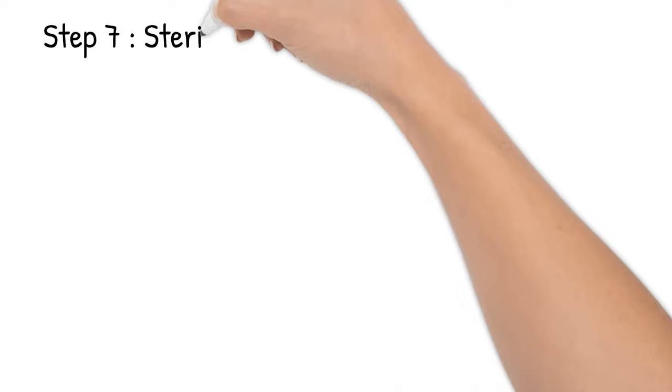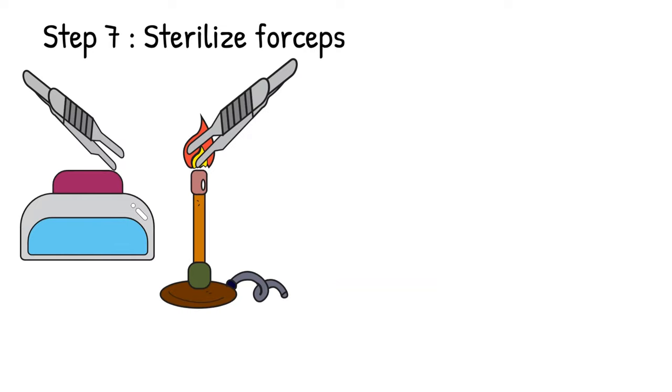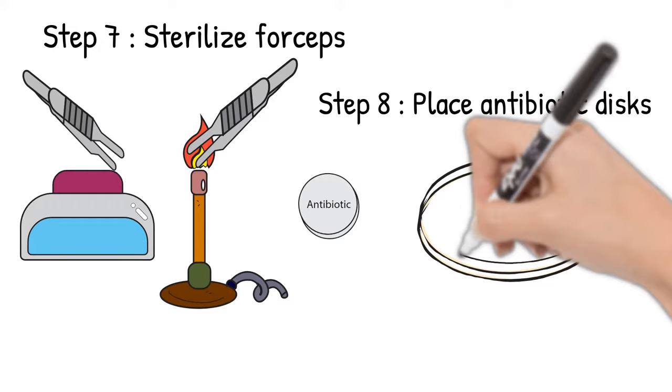Step 7: Sterilize forceps by dipping it in alcohol and pass it through flames. Step 8: Pick up an antibiotic disc and place it on the plate.